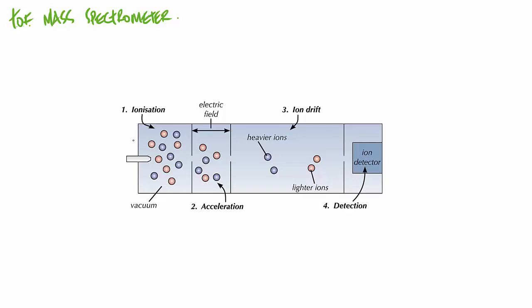So ultimately the way this works is you take a sample that you want to analyse and put that into the ionisation chamber. There are two types of ionisation that can occur, and I'm going to ignore one of them because I just think it's ridiculous. Electrospray ionisation can happen. Now, in March 2016, they decided to add a different type of ionisation in.